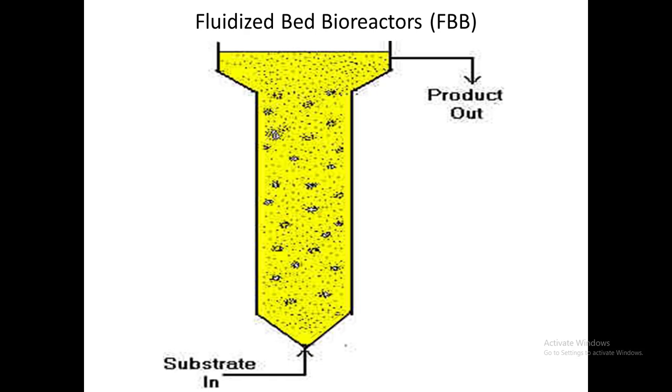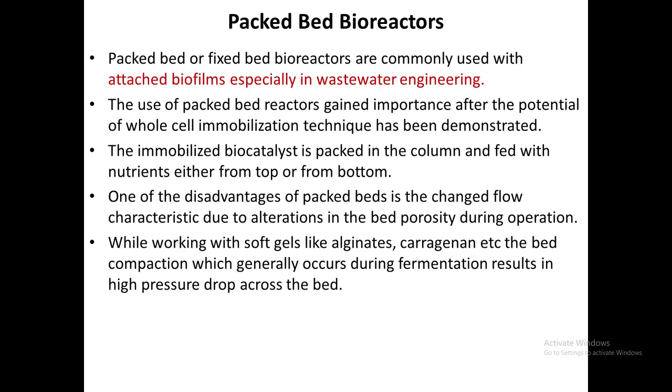This is the diagram. The packed bed bioreactor uses biofilm attached in wastewater engineering. Diagram.